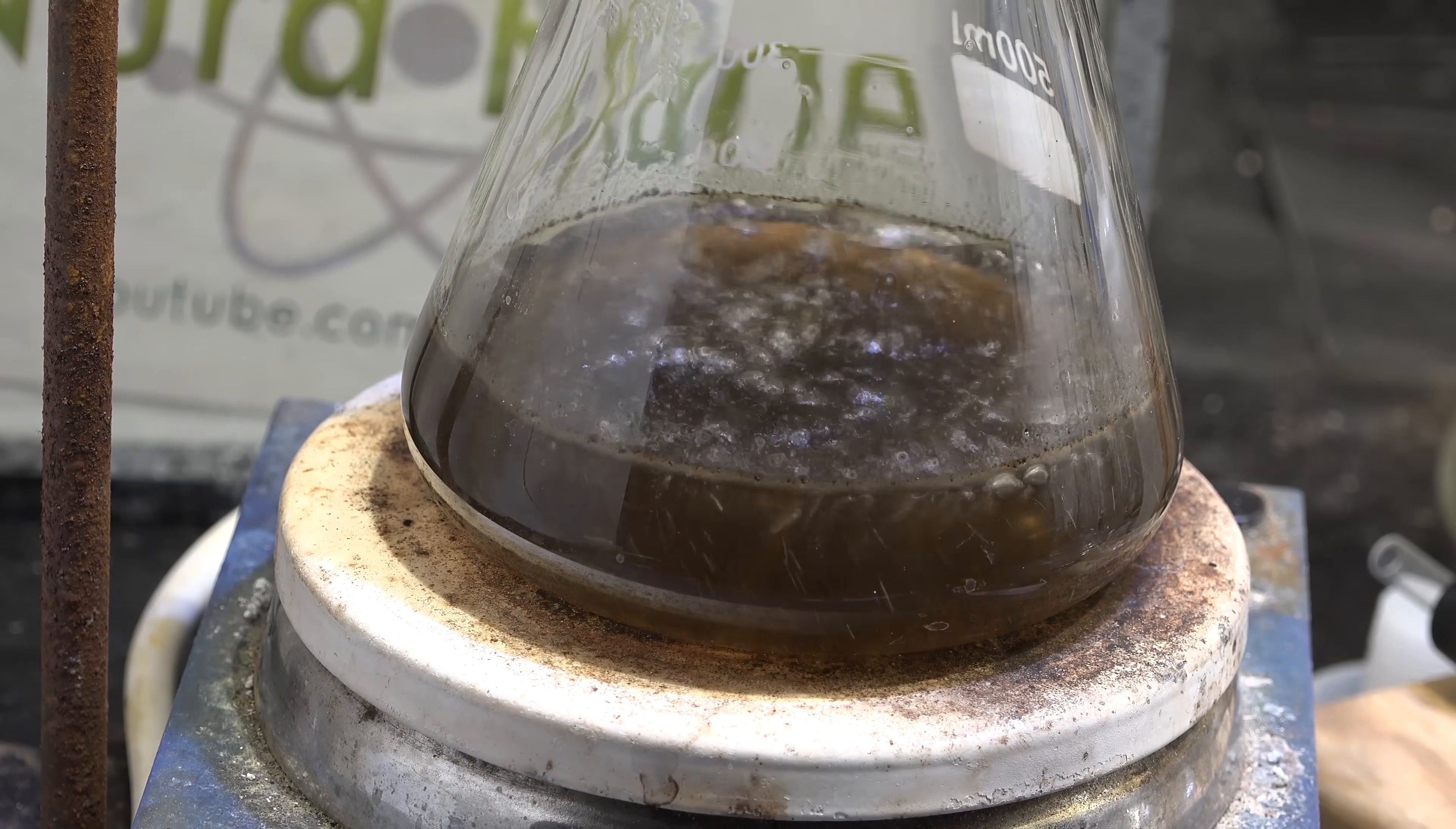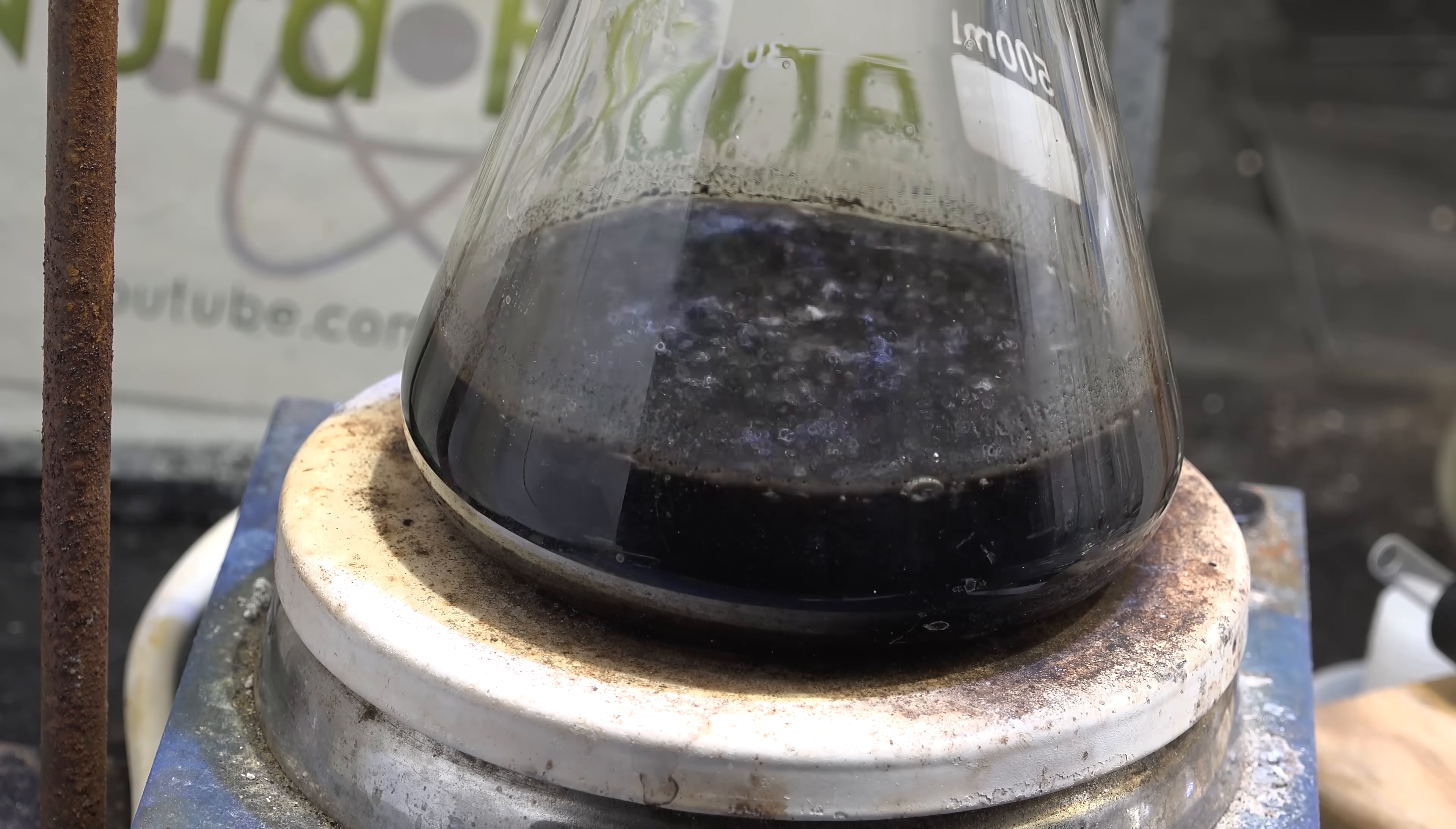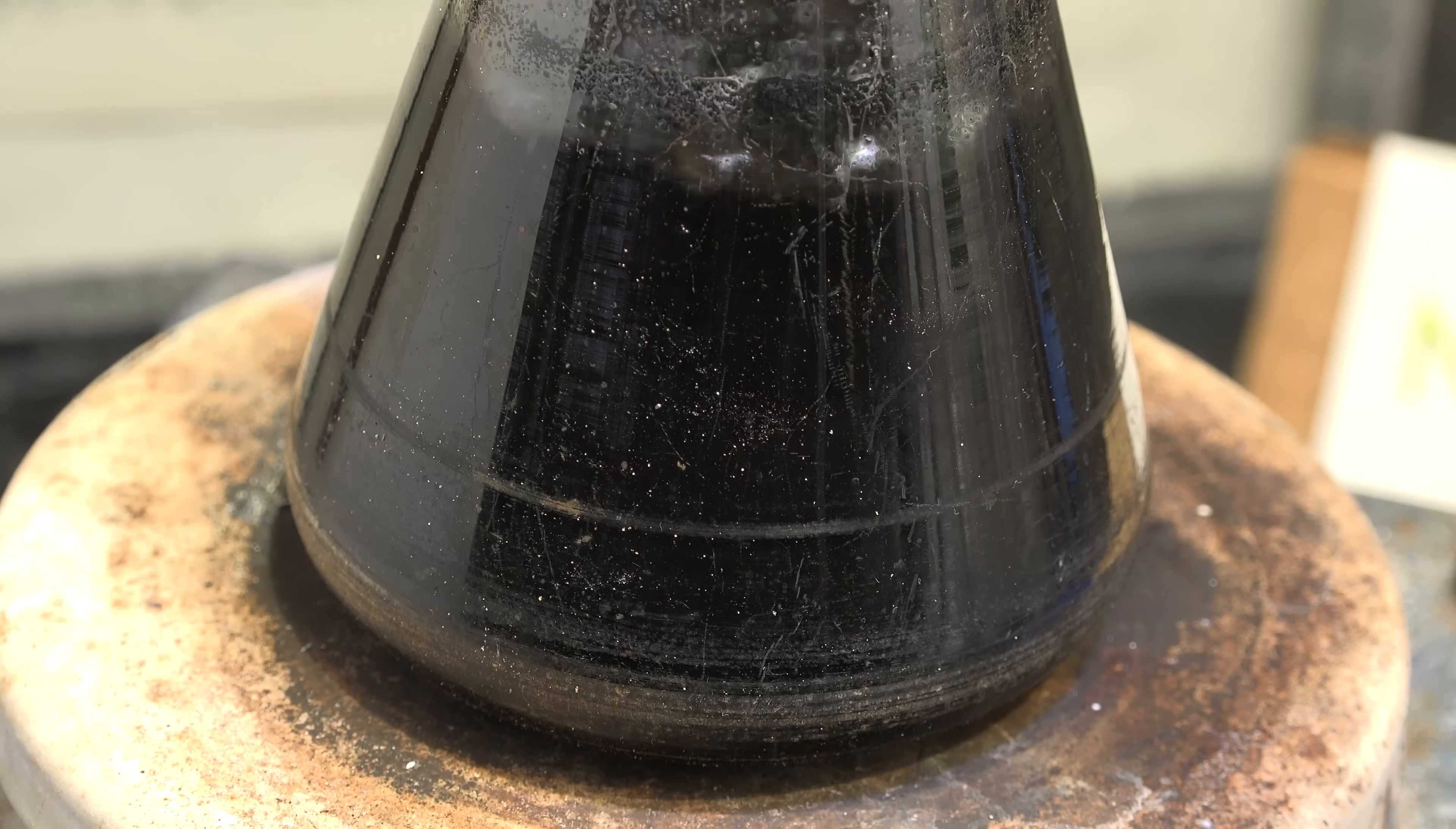I found out later that the tetrahydronaphthalene can react with sodium and produce tar. The reaction is slow but enough to shut down the catalytic reaction. At this point though I've been spending months on this project and needed to reevaluate whether it was worth continuing or abandoning.